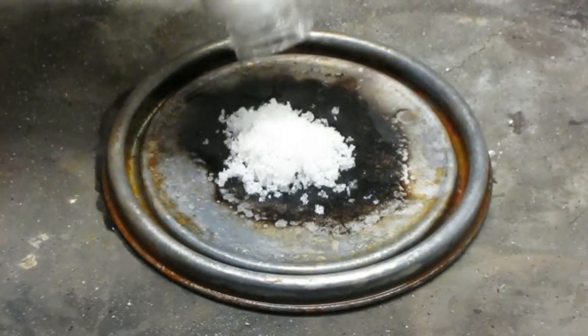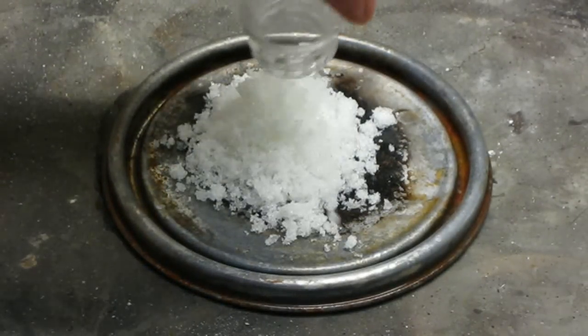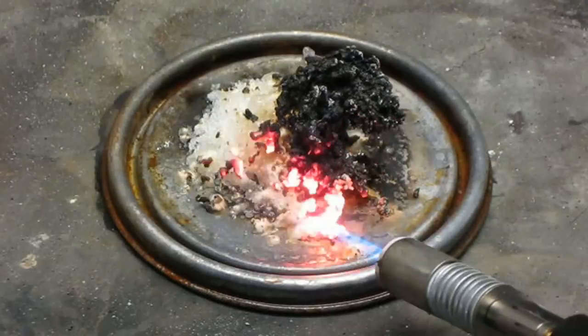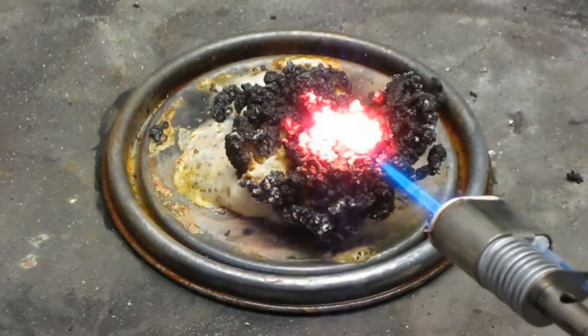Before you get any ideas, you cannot use aluminum nitrate nonahydrate for pyrotechnics. Here is a mixture of sugar and aluminum nitrate nonahydrate. As you can see it doesn't burn but instead turns into this rubbery mass of carbon and aluminum oxides.